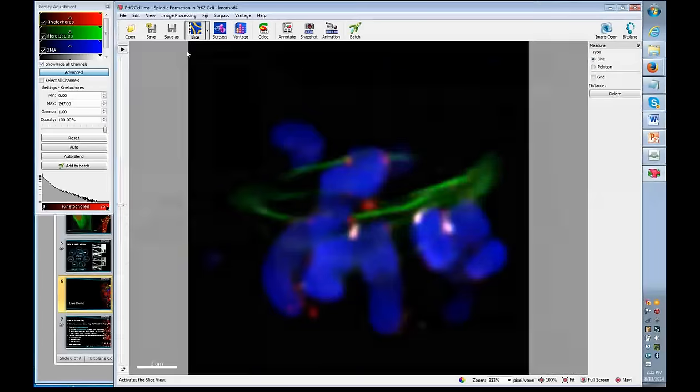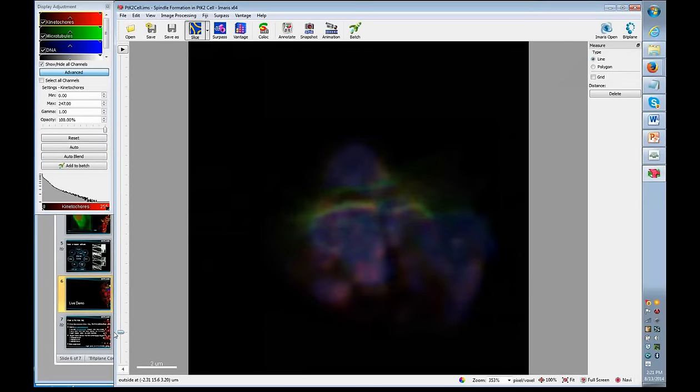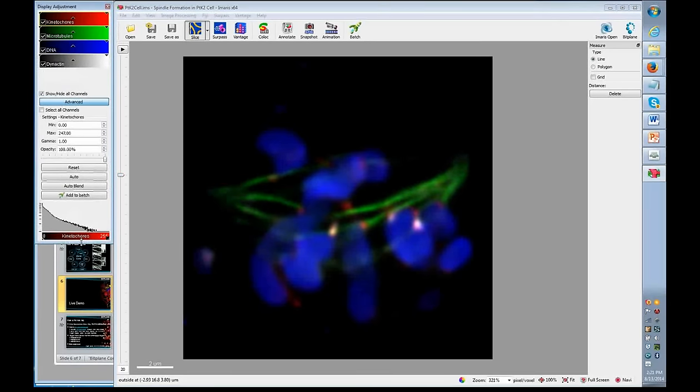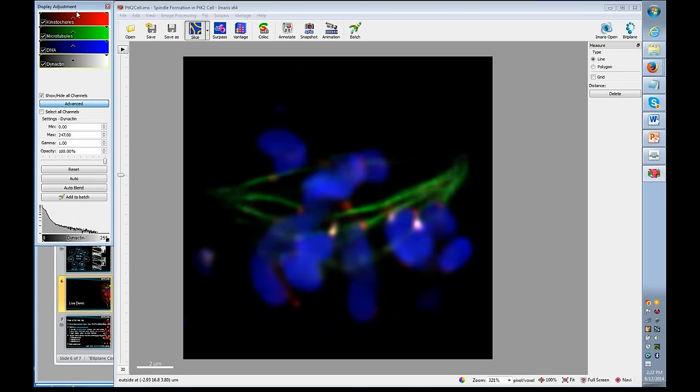Once you have the image loaded in, if we switch over to the basic slice view here, the first one is showing us each of the individual focal planes that were shown in the PowerPoint slide earlier. And then over here, the display adjustment window, which I'll extend a bit, shows that we have 4 channels, and we have some channel visibility options. We can completely hide a channel, or we can adjust the contrast using these 1, 2, 3 arrows, which are linked to the boxes down here if you want to just type in a value as well.